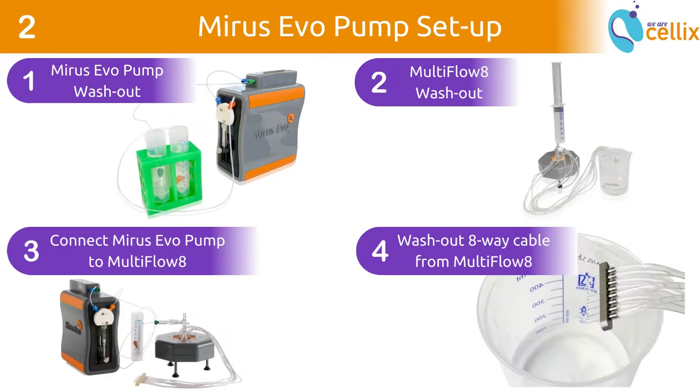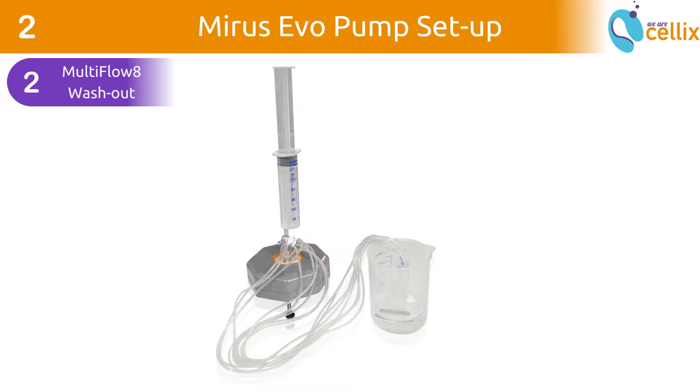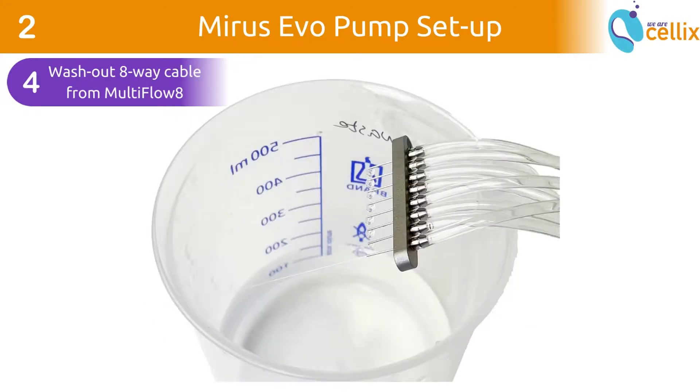This chapter is divided into 4 sections: 1. Wash out Mirus Evo pump. 2. Wash out Multiflow 8 and remove any bubbles. 3. Connect Mirus Evo pump to Multiflow 8. 4. Wash out 8-way cable from Multiflow 8.